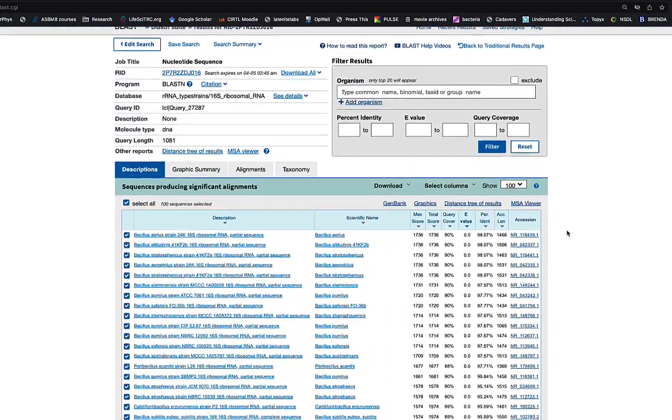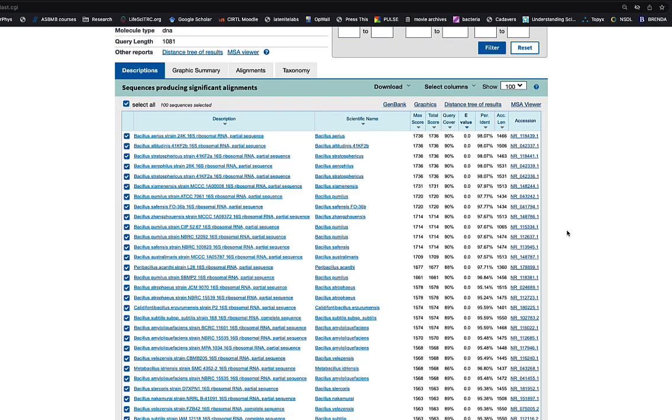And this is what you have, and you can look at these results in different ways, but let's look at the numbers. The numbers on the right express different parameters related to the coverage, so the matching of the sequence to whatever sequences exist in the database. The e-value is going to express how close this matching is, and the smaller the number, the better. And as you can see, all these sequences in the beginning are 0. Considering this is a bacillus, this is a very common occurrence.